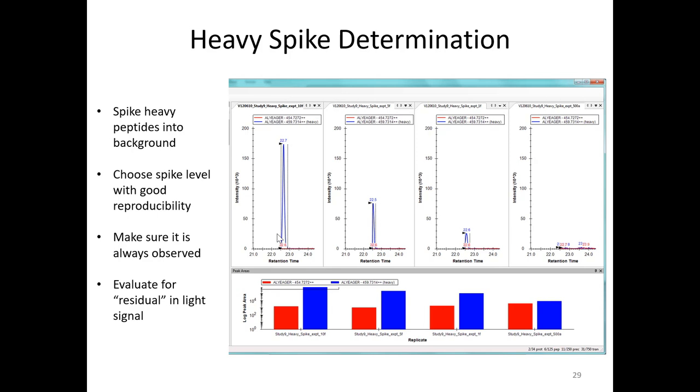It's not a huge signal, but we wanted to make sure that across the different vendor instruments, and also a series of generations of different instruments, we had a SciEx 4000 Q-trap and a 5500, and I believe a 6500. So a 6500 would have no problem with that, but the 4000 we would want to make sure that we weren't cutting it off at its knees on not being able to detect reproducibly enough.